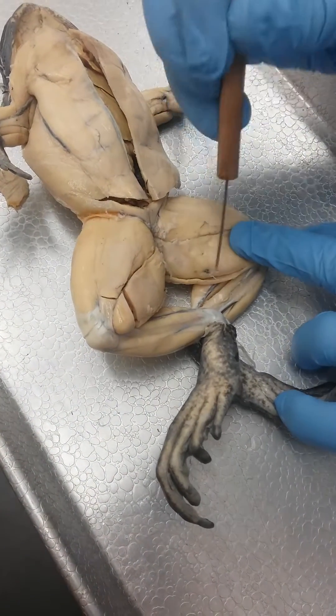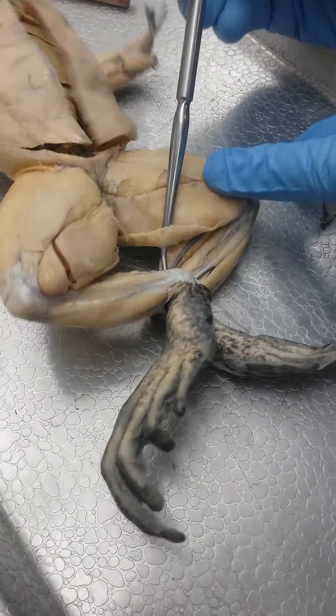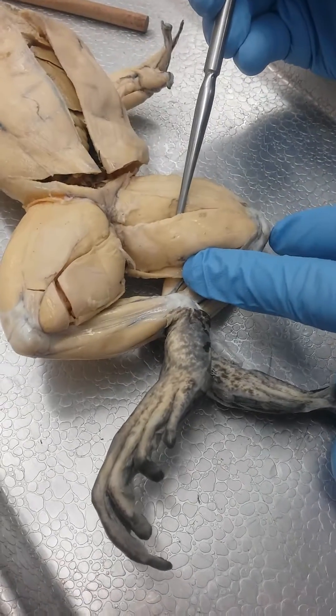This one right here is gracilis minor. And then this one right here is gracilis major.